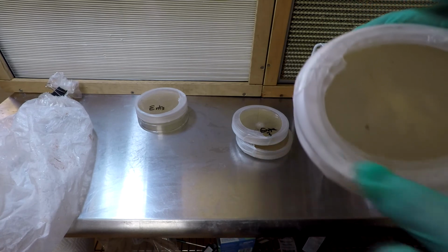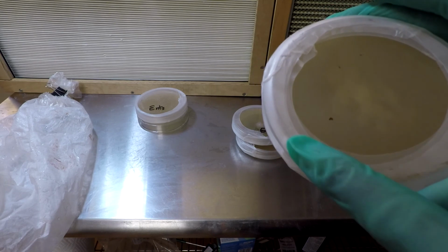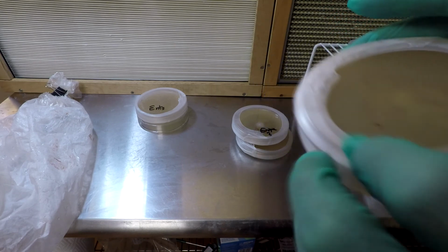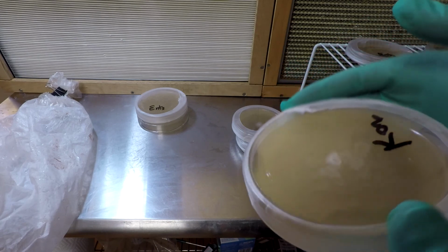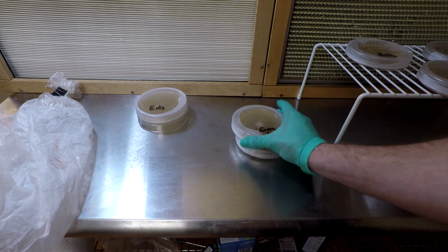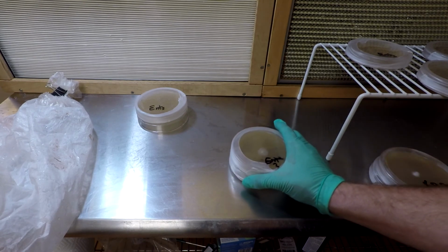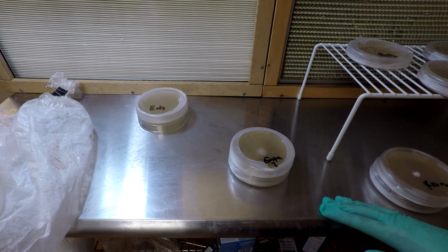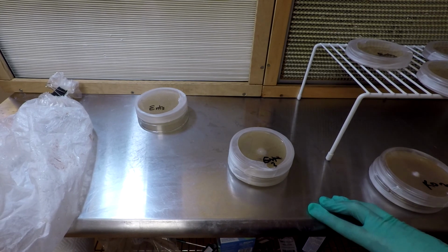So it's not a safe zone right there. As soon as you get water in that space, bacteria can cross over, grow into the dish really fast, so that's why that didn't work. But yeah, store your dishes right side up and they should be fine as long as your transfer and culture is clean and your procedure is really good and secure.